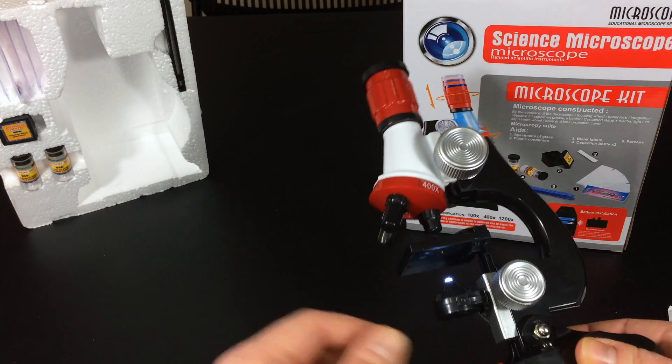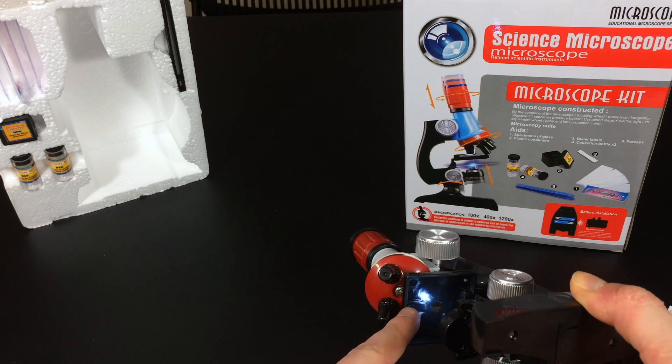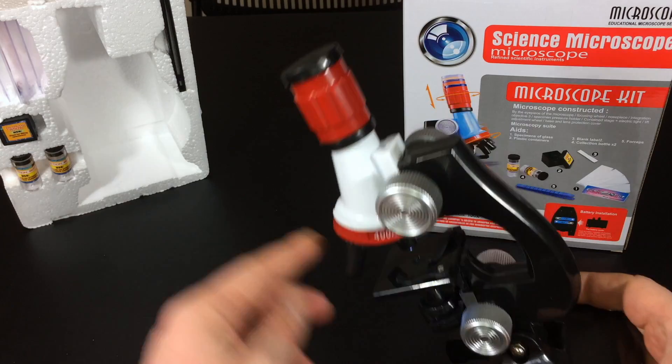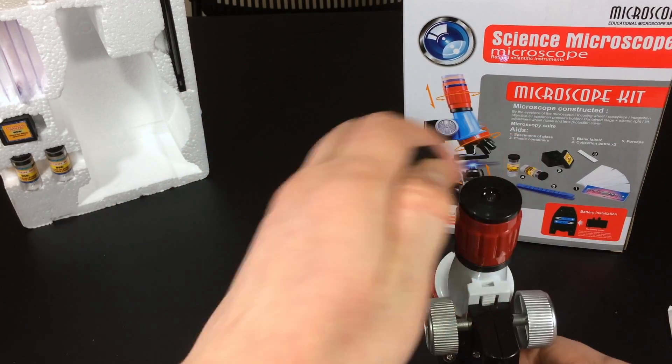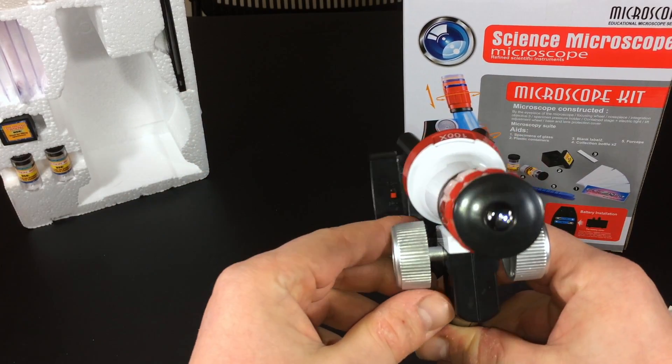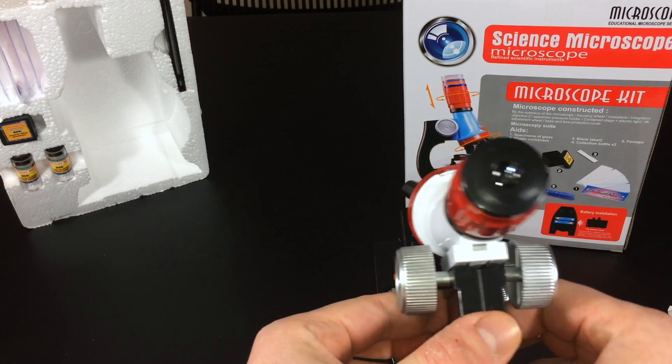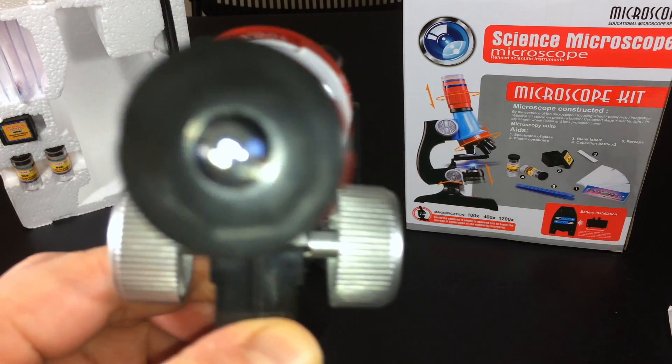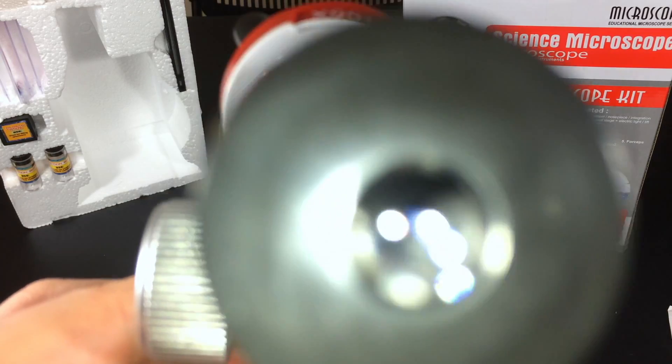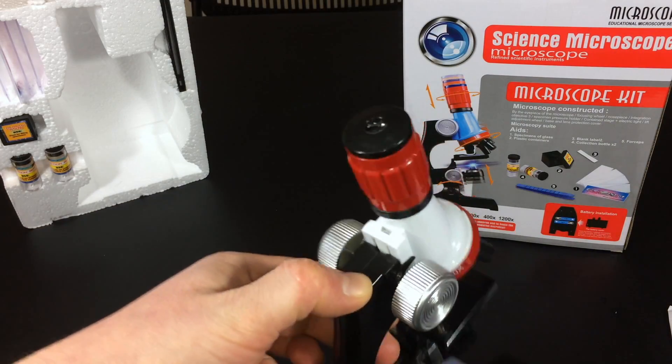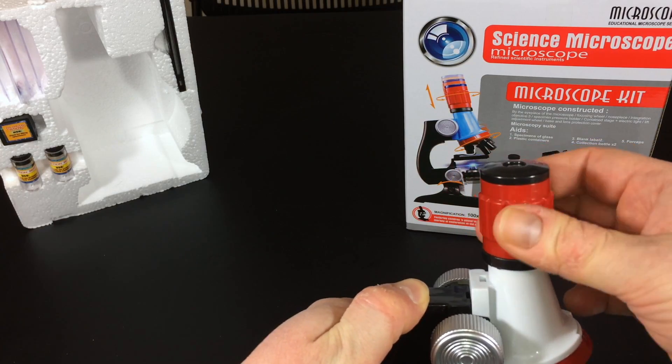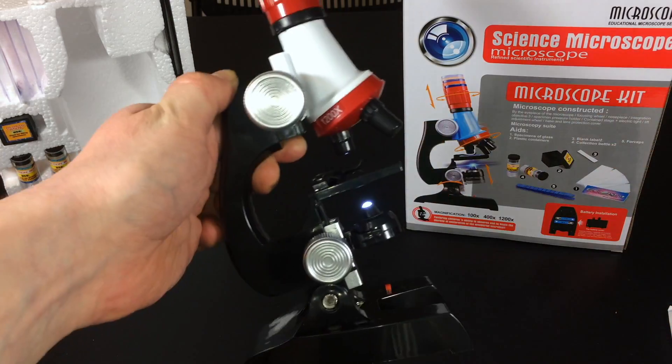So that should be able to come up straight through to the lens, as you can tell right there. I'm pointing to it with my finger. And we should get a pretty good image through the lens here on top. It has a cover and it looks like that. We're going to try to get some objectives here going right now. But I'll try to get some good images here of the lens itself. It's a little bit tough, but we'll be able to see something. You also have an adjustable piece here on top for basically eyesight from my understanding.